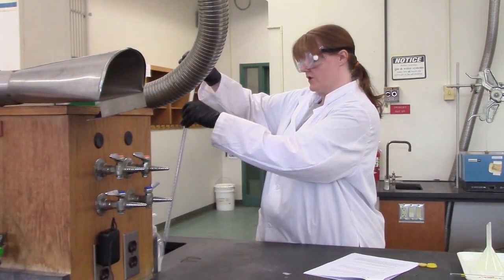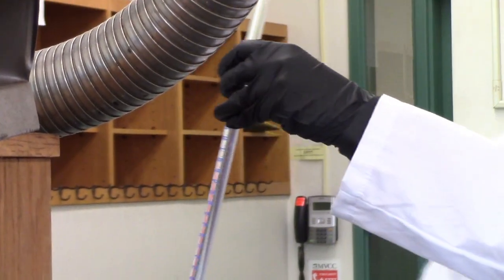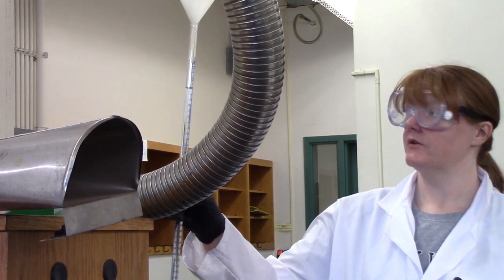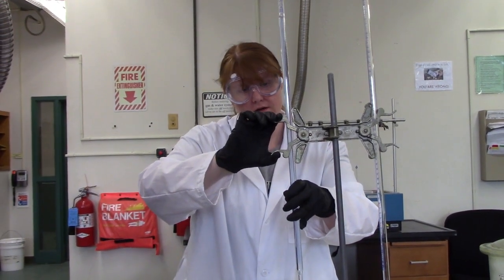It doesn't have to go to the zero mark exactly, because you're going to record an initial and a final measurement for every titration that you do. No way, you guys aren't going to believe this. It's perfect. The odds of that are astronomical. That was just luck. It's not skill. Although titration is a skill that you get better at with practice.